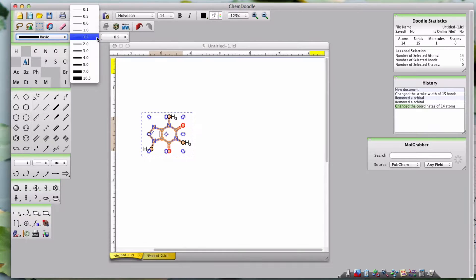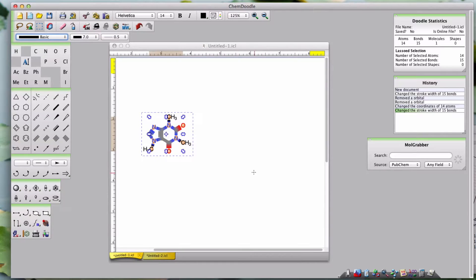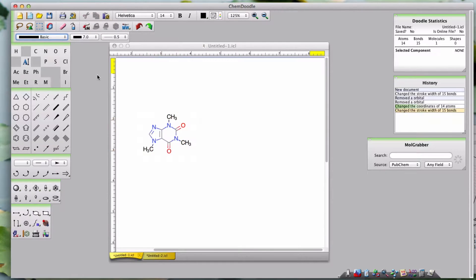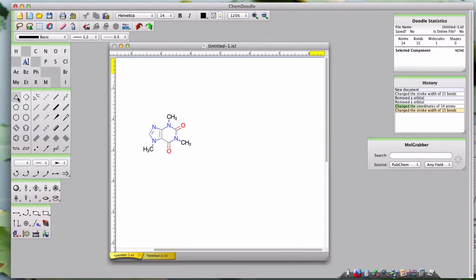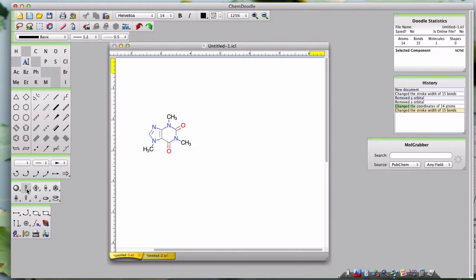The Strokes toolbar provides settings which affect the size and style of bonds drawn. The remaining toolbars only alter the result of left-clicking the mouse button. These toolbars are labels, rings, bonds, arrows, orbitals and shapes.